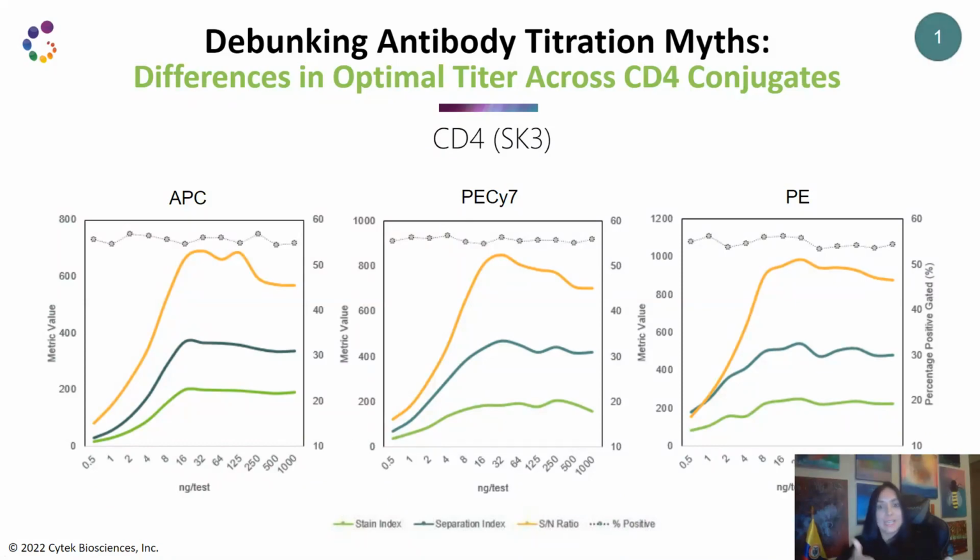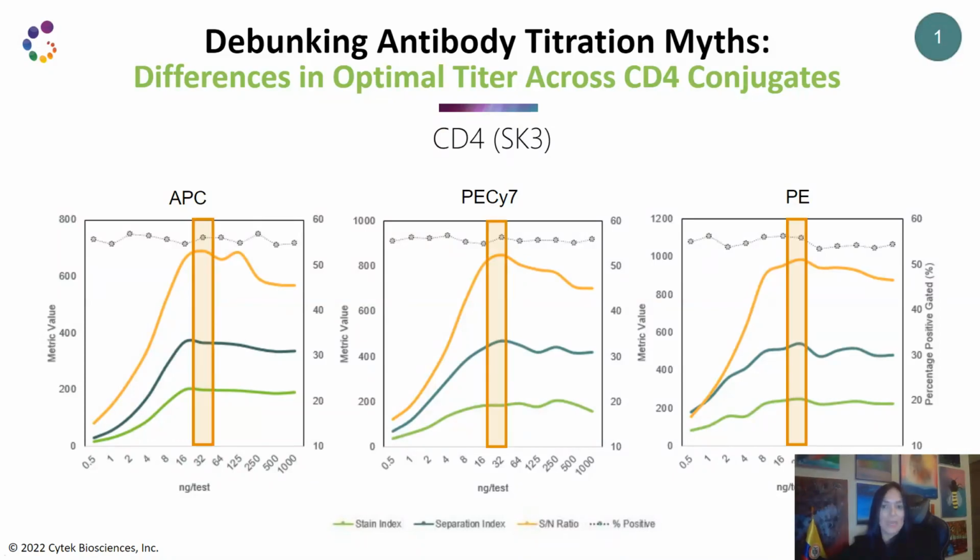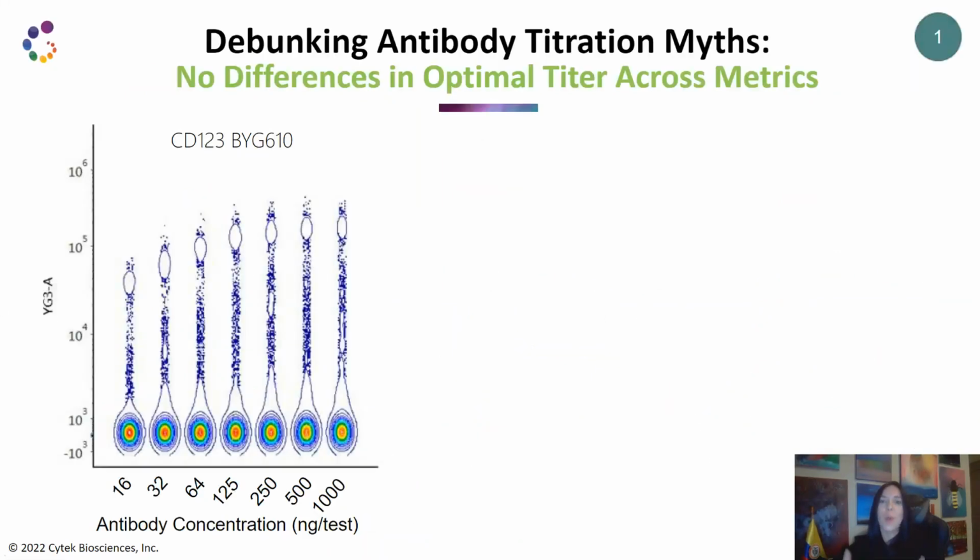So you see, same marker, the trend is very similar in where you're getting to that plateau, which is the optimal concentration as well, and how for CD4, percentage of positives is not that informative because you can still gain because of separating concentrations.